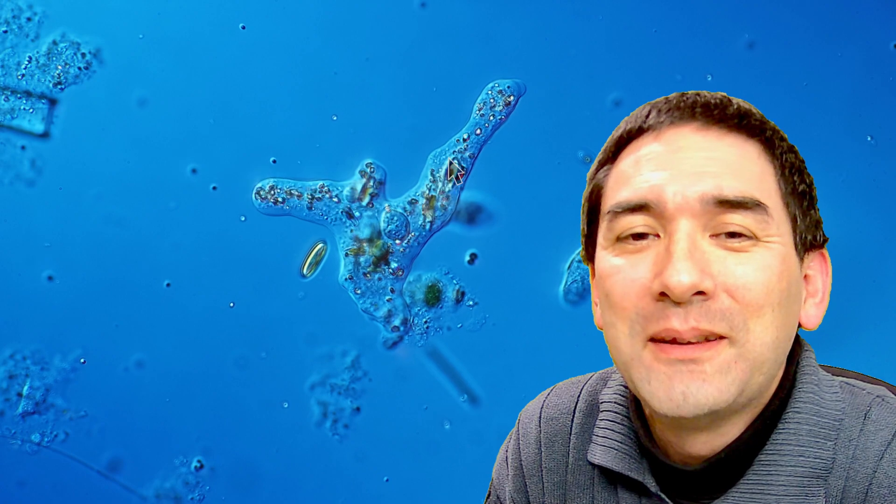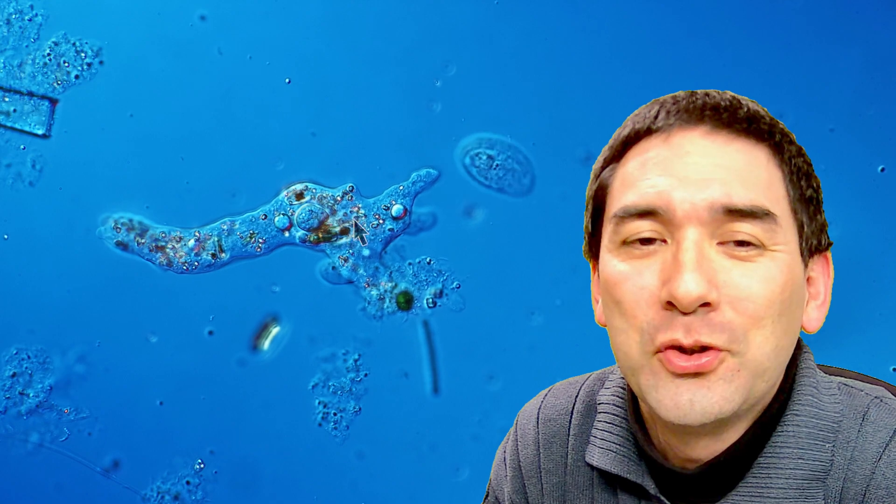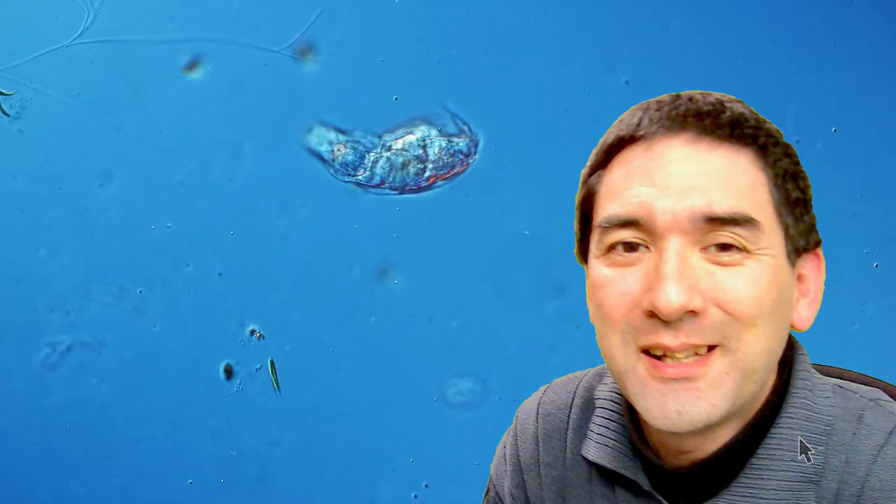You can see quite nicely in here diatom shells and all the other algae, maybe a whole bunch of bacteria as well, and those large circles that you see here are quite well possible that that's the nucleus of the amoeba which contains the DNA.